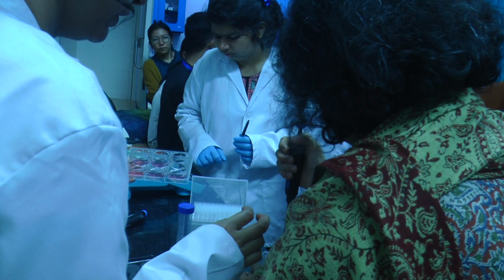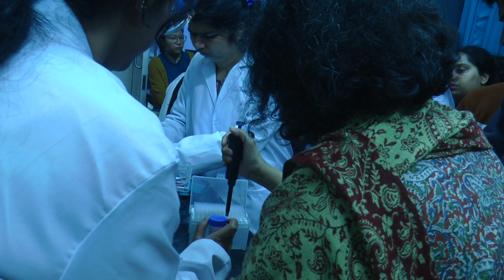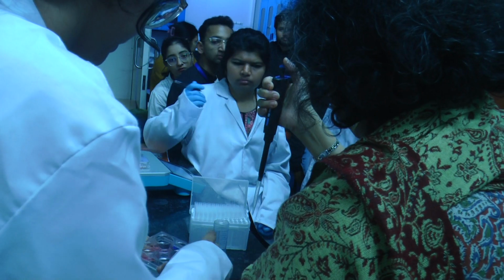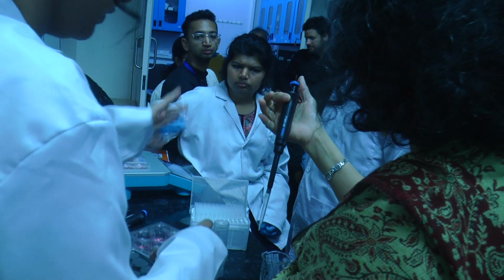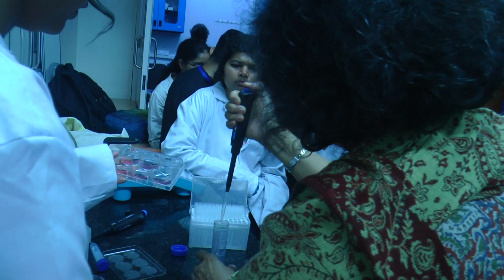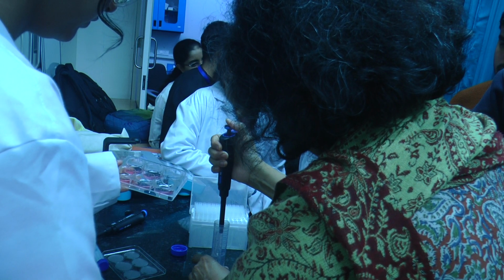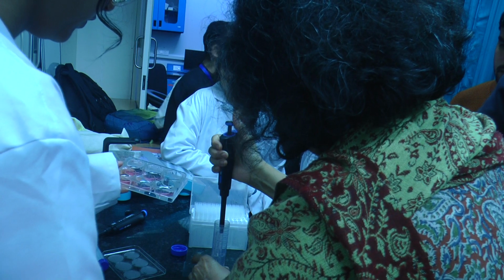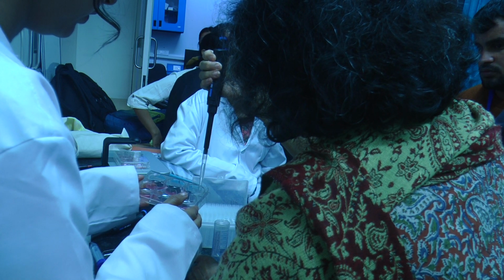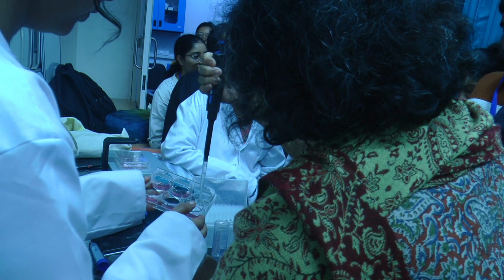Just press it. Take one more. Now you can take. Wait, I'll set it for this. I think 1 ml is enough. This much is 1 ml. Alright, so I just do it again. Fully press. Take one more. Okay. Now add it slowly, all over. You can tilt it a little also so that it moves there.